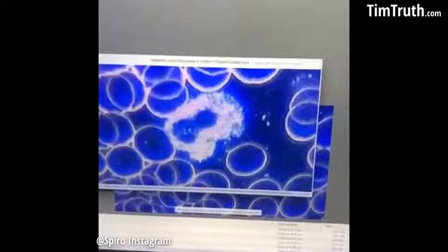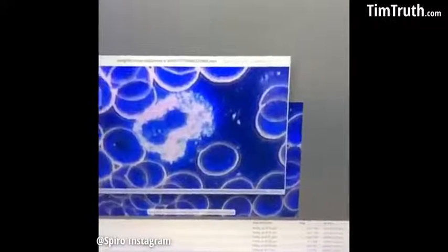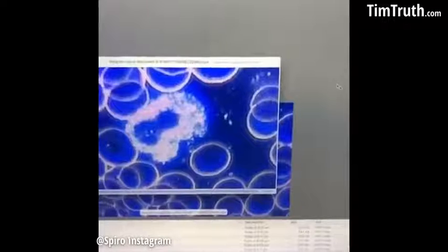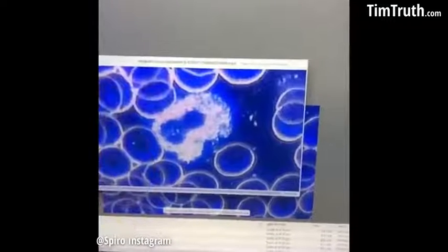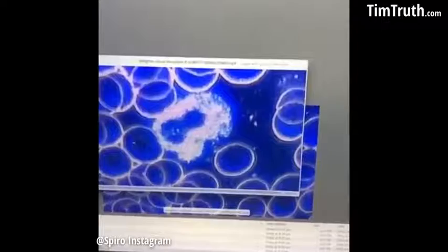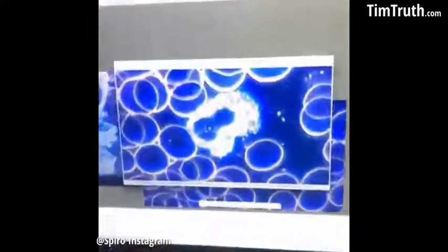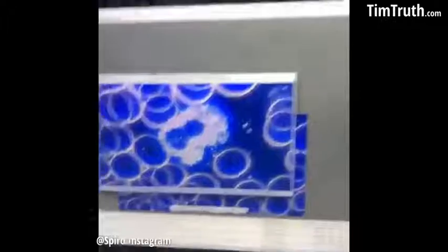I would say this is a cell that reacts to something toxic or wants to defend itself, because I have never seen a white blood cell like this. So it was for me also like, wow, what's this? Why is this so aggressively working? Like you could say if an autoimmune activity or something goes on, the cells attacking something very strong. So it was not a normal white blood cell which we saw here.